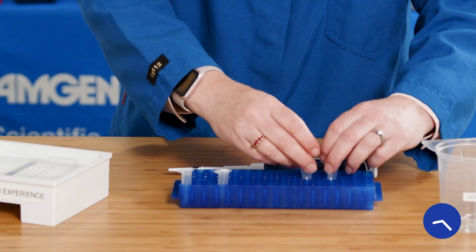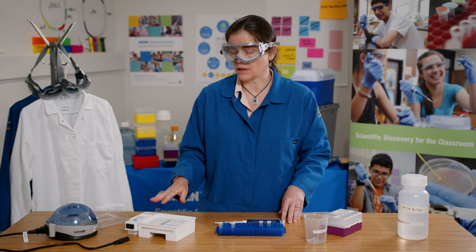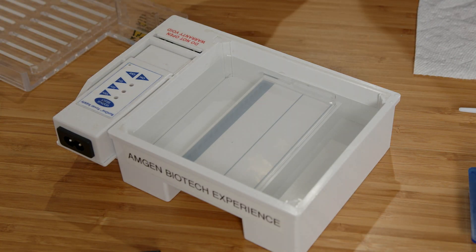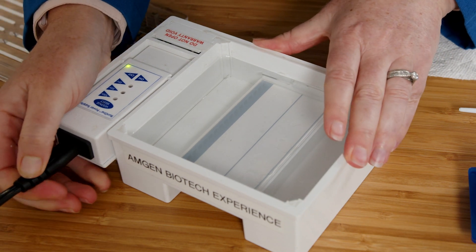Now I'm ready to load the samples into my gel. Notice that my electrophoresis chamber is already set up. I have a gel in place and I've poured buffer just above the level of the gel. I can plug my electrophoresis chamber into the power source and I'm ready to load my gel.